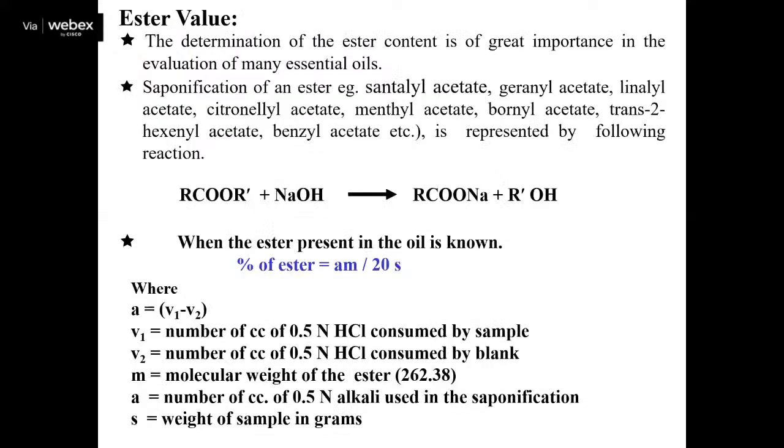Now the ester value. The ester value has a description in the Indian Standard. So what is ester value? The determination of ester content is of great importance in the evaluation of oils, including sandalwood oil. Here we saponify the ester, in the case of sandalwood oil, santalyl acetate, using alkali, and the excess alkali is back titrated against the blank. Using this formula, we can get the ester value.